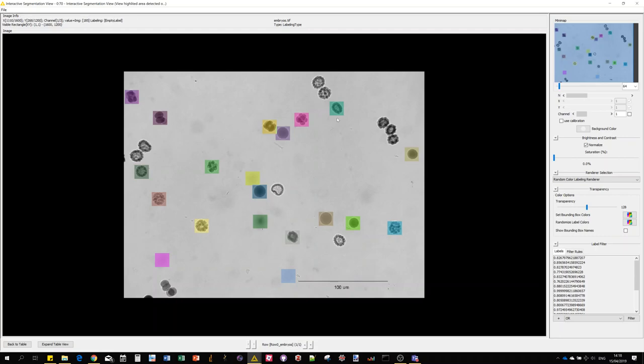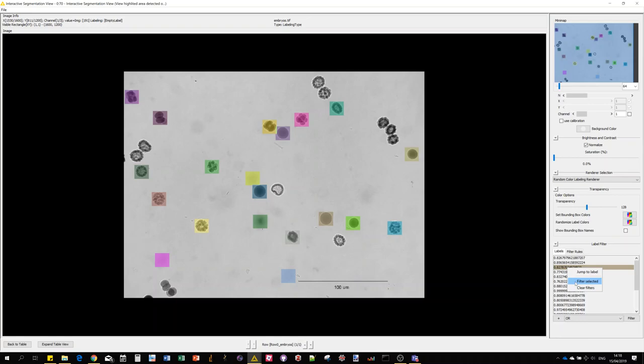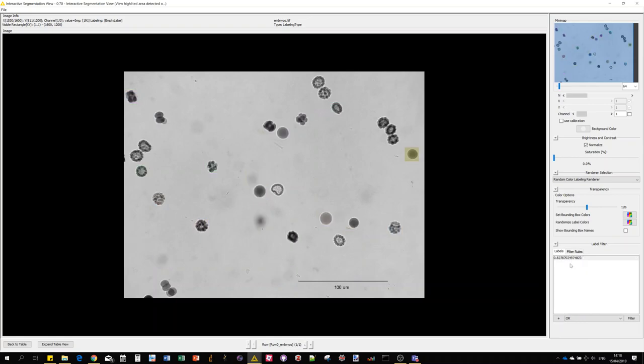I could increase possibly the number of objects and maybe decrease the threshold to try to catch more objects. For each detection you get the correlation score here and you can also isolate them by right clicking and selecting filter selected. Then you just see what object and what score is.